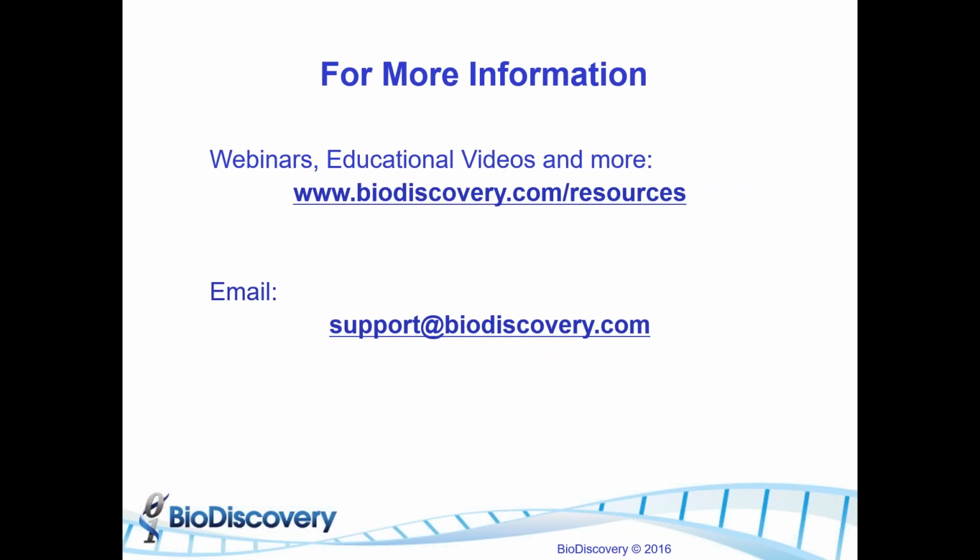Okay, what is the ideal coverage of whole exome and targeted sequencing data for copy number analysis? That's a really great question. In general, deeper sequencing is going to be better. In terms of the percentage of genome, whole exome is typically going to offer us more detail than targeted sequencing, and the deeper the sequencing goes, the more reliable our results are going to be. For constitutional samples, you don't necessarily have to go as deep as you do for cancer samples to catch reliably all of the calls. And this again has more to do with the mosaicism of the sample.